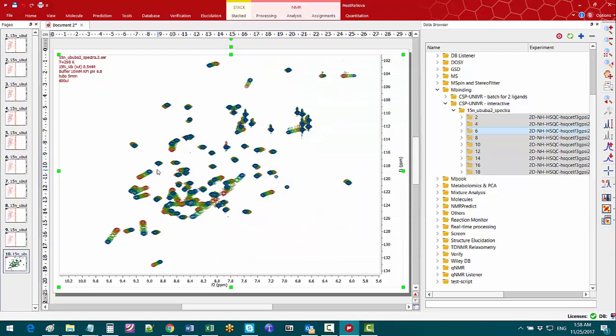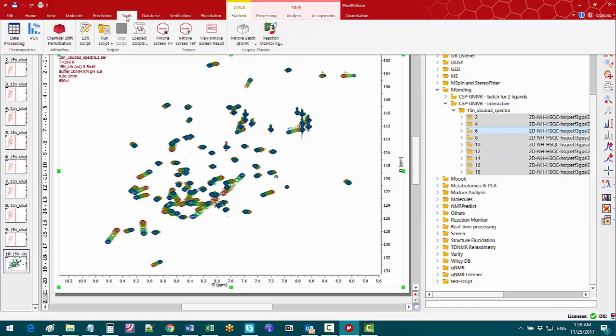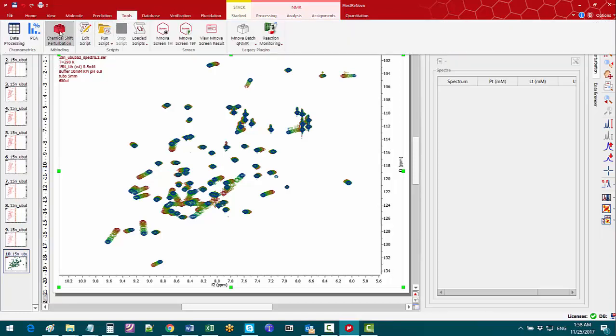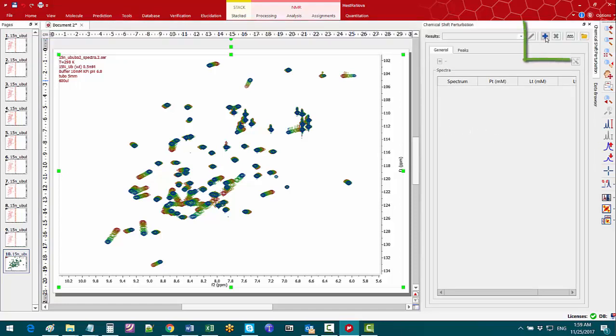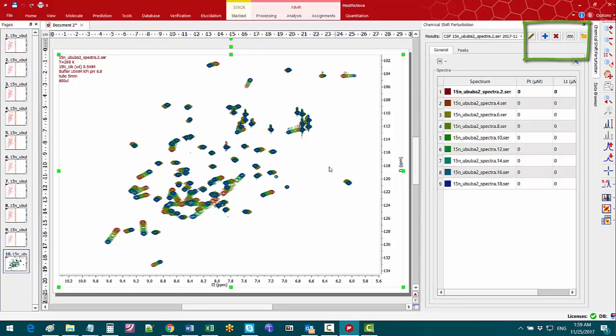Now back to the MNOVA menu. Choose tools ribbon and click on the MNOVA binding tool to display the chemical shift perturbation panel. In the tab general I click on new analysis to use the nine spectra of this titration series to be analysed.